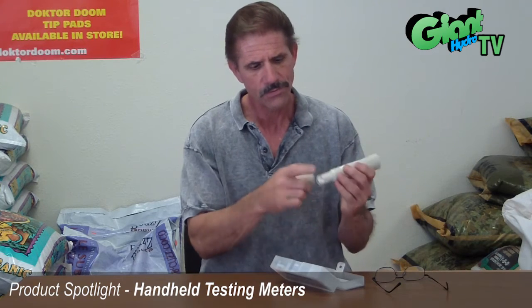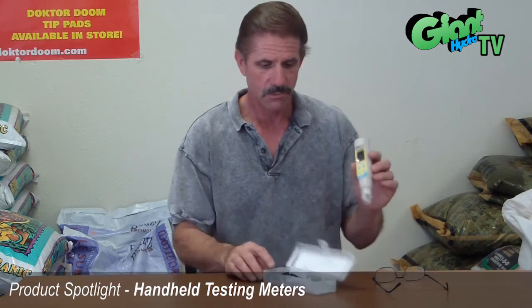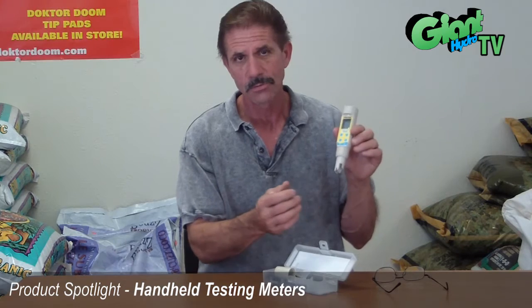It's pretty simple. Also, if you ever have a problem with the tip, these tips are replaceable, which makes the meter brand new if you accidentally let it dry out or you dip it in the wrong solution. So basically, this makes it real simple to do the three tests.